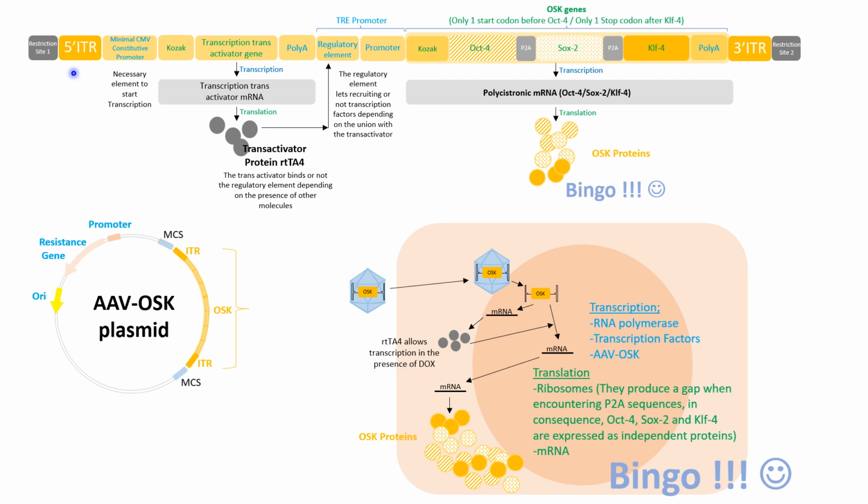Okay, but the first thing that we require is two ITR sequences. The ITR sequences are the inverted terminal repetitions. And we need one in the 5' and another one in the 3' side. So here we have the 5' one and the 3' one. These sequences, as I have told you, label what is in between them.